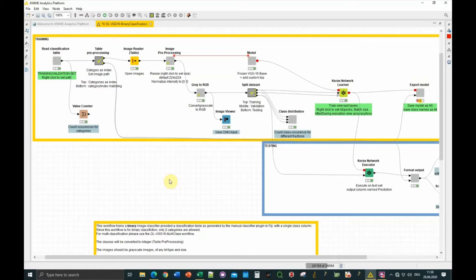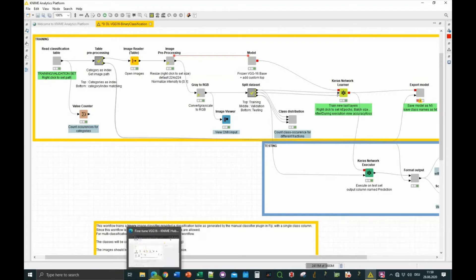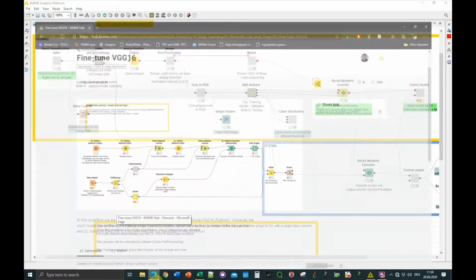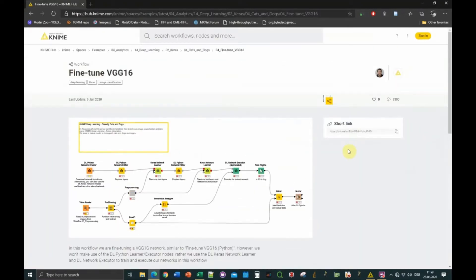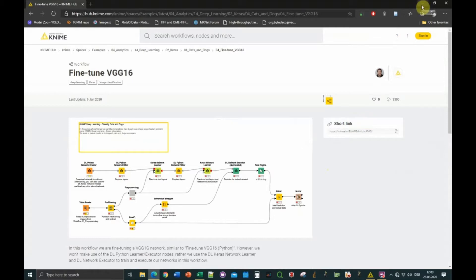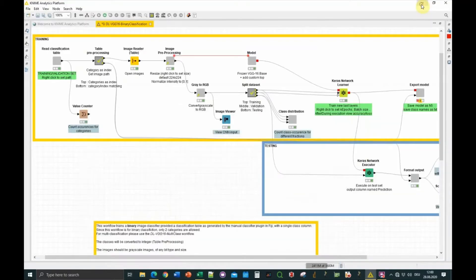I have adapted an existing workflow that was available from the KNIME team, from Christian Dietz on the KNIME hub, which allows to fine-tune an existing deep learning network that was trained to recognize cars and stuff like this, and then fine-tune it to train it on your own custom classification problem.